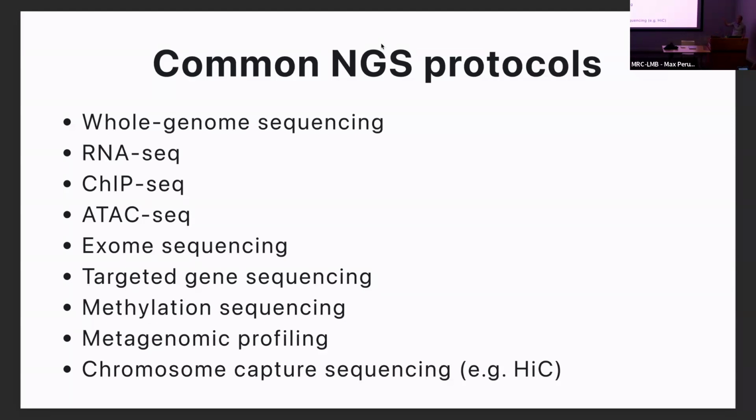Metagenomics as well, so the idea you could go out on a boat, fill up your collection vessel with seawater, extract the DNA and then sequence it and work out all the organisms in there. Next generation sequencing's made that possible as well.